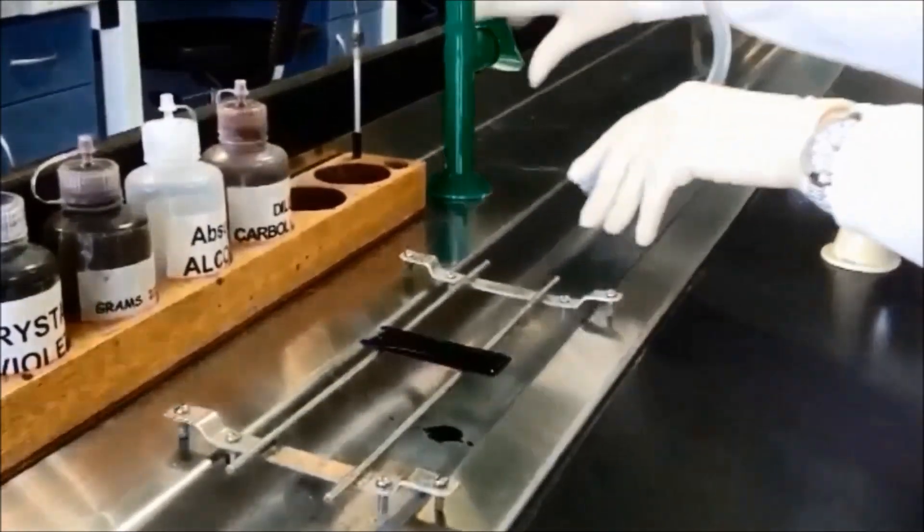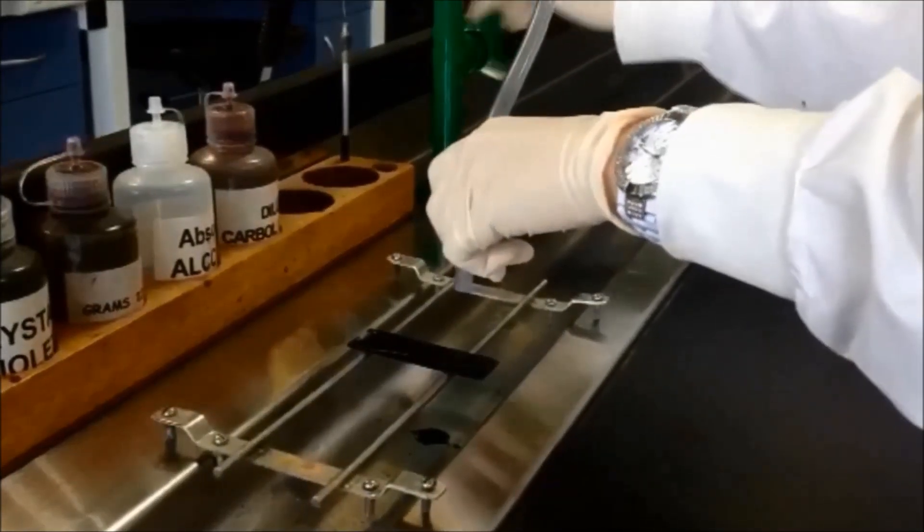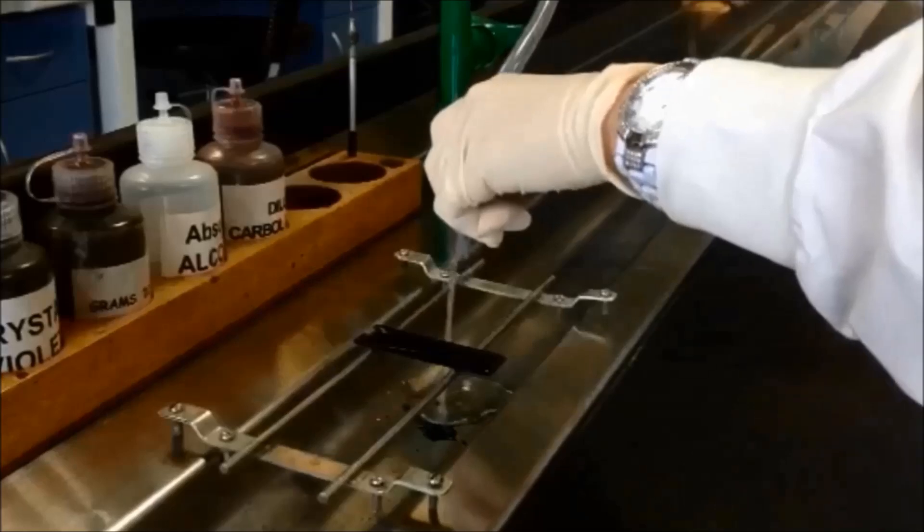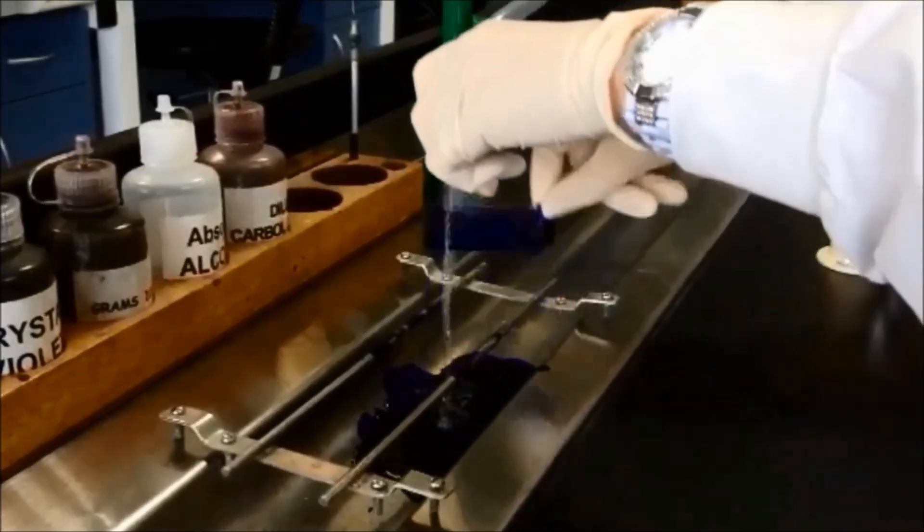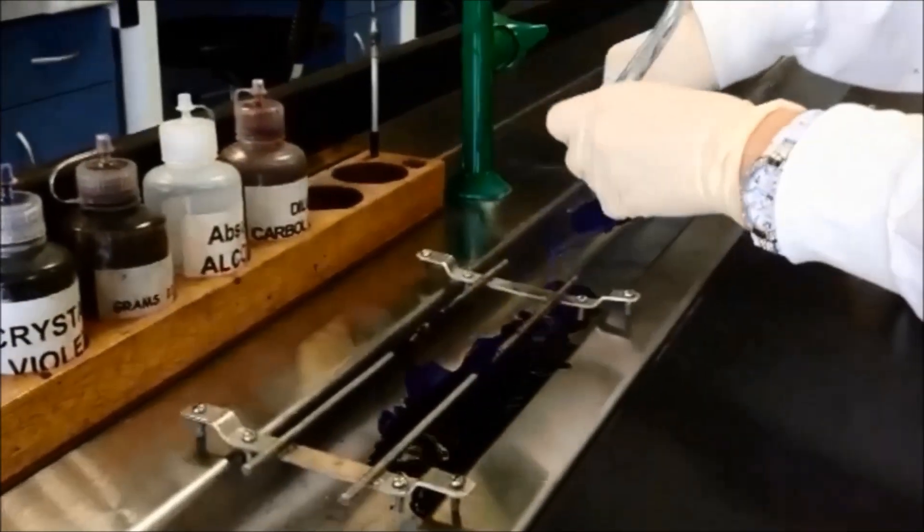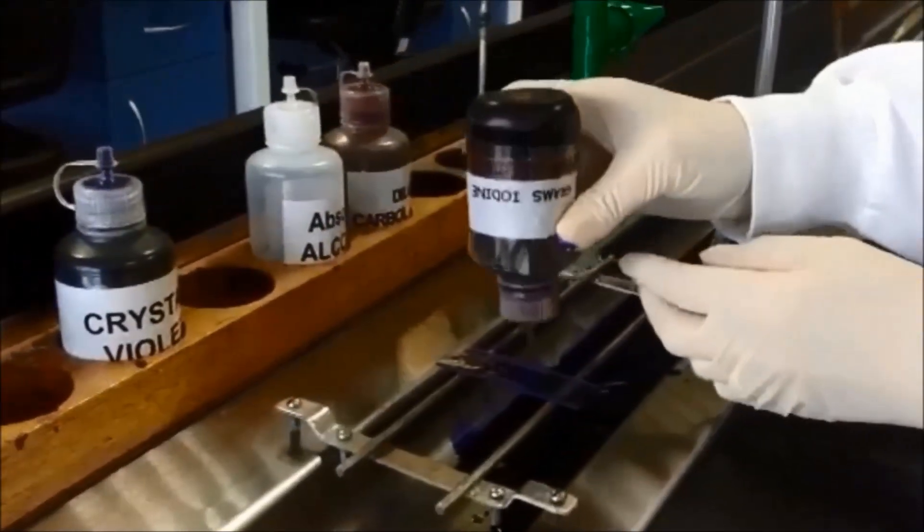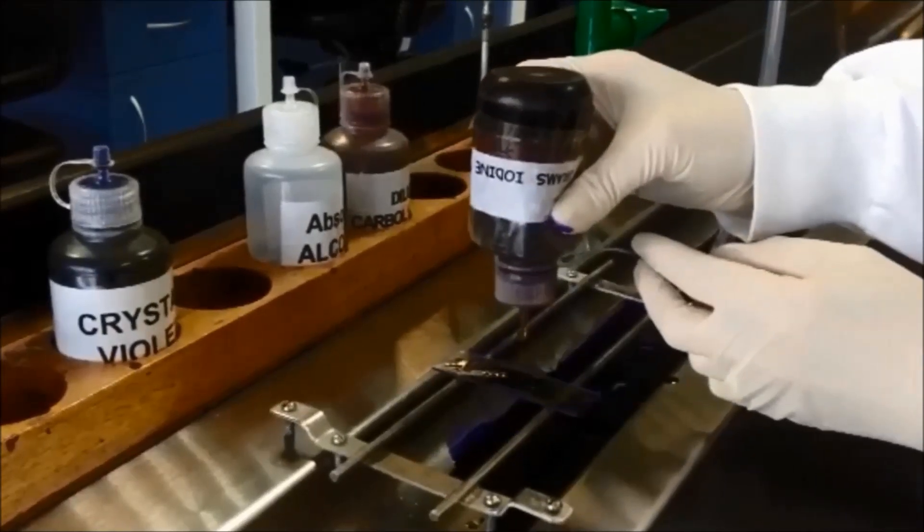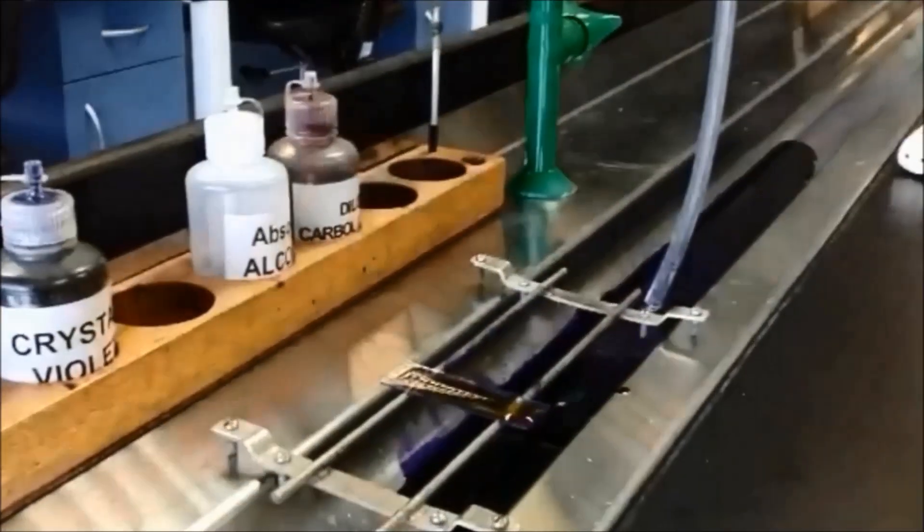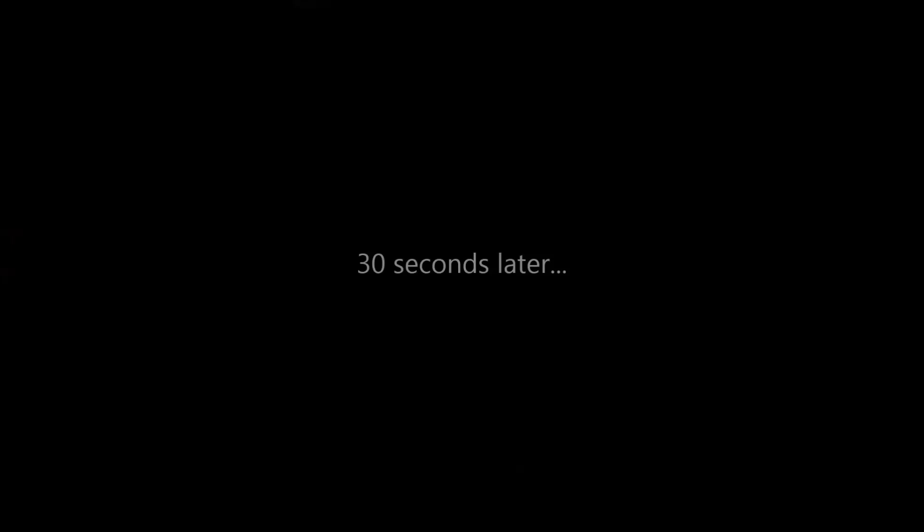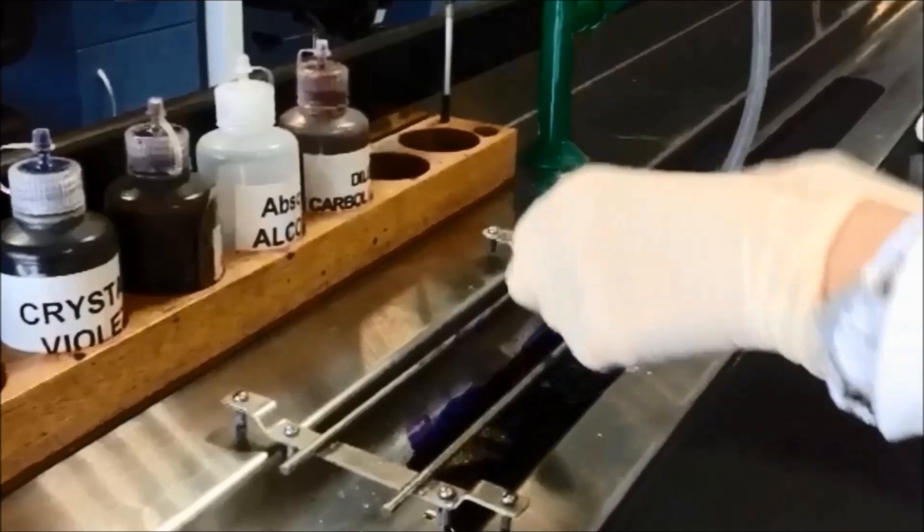Quickly rinse off the stain with a thin stream of water from the tap. Tip the slide at an angle to remove excess water. Pour on the Gram's Iodine Solution and allow to act for 30 seconds. Rinse off with water.